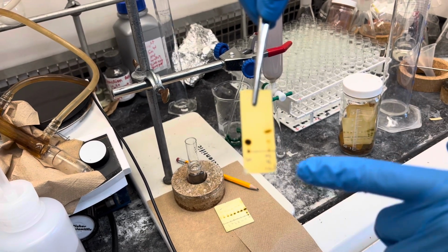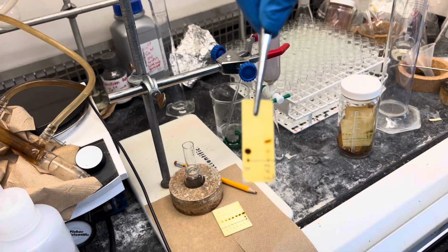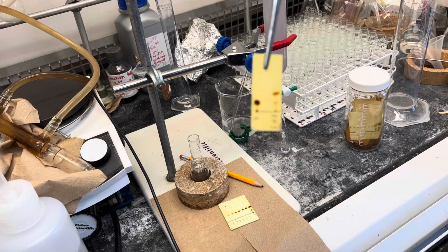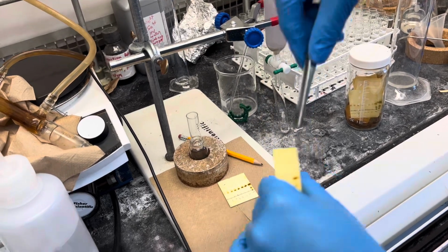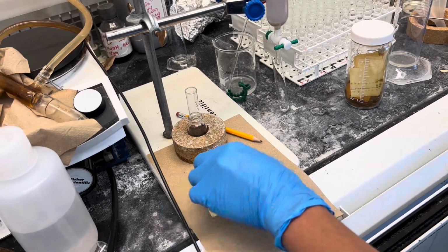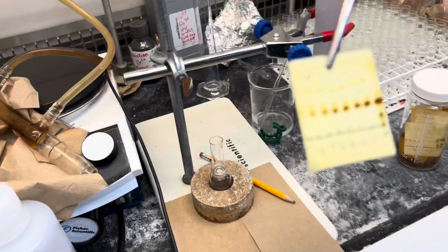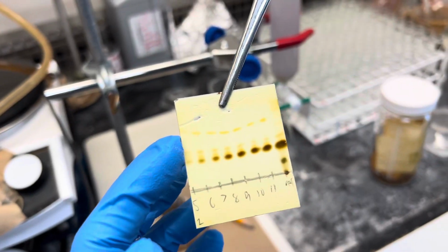So it looks fine. So I said, hey, it's right here. RF is about 0.3. This is good. So we can go up to 20% potentially. Obviously, we're gonna go slowly. So I went 0%, then started climbing 1, 2, then 3%. Here we are at 3%, and all these impurities are stacking up.